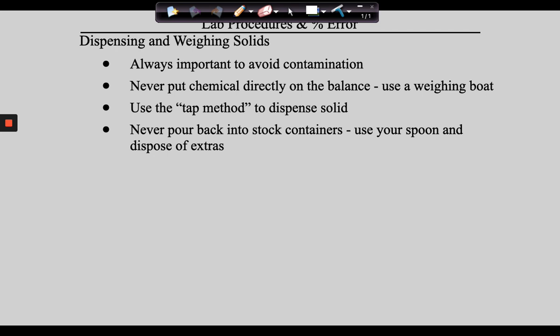But, guys, now I've got too much salt inside of here, so what do you do? What you do is this. You pick this up, you scoop up some of that salt, and when you put it back, now it should weigh less than a gram. Then you're going to carefully tap again, get up to a gram, and then if this came with the beaker, you can just put that back and you're all done.